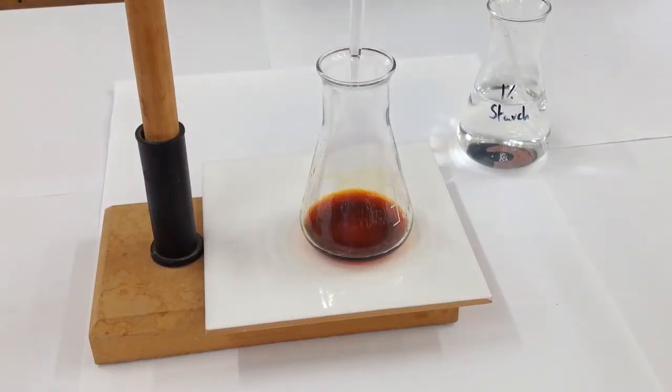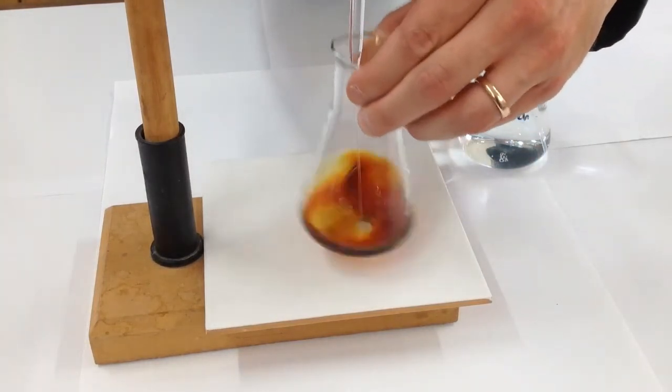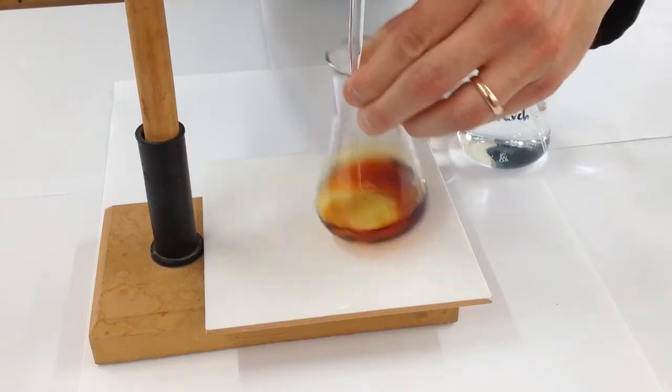In this next demonstration we've got still sodium thiosulfate in the burette and aqueous iodine in the conical flask beneath. Now the previous one, where we added the thiosulfate directly to the iodine, gave a gradual loss of the brown colour. That's not very good for titration. We want a sharp colour change. So we're going to use starch as an indicator. We don't want to add that initially because it will bind too strongly to the iodine and give us inaccurate results. So what we do is we add some of the thiosulfate until the colour has faded.